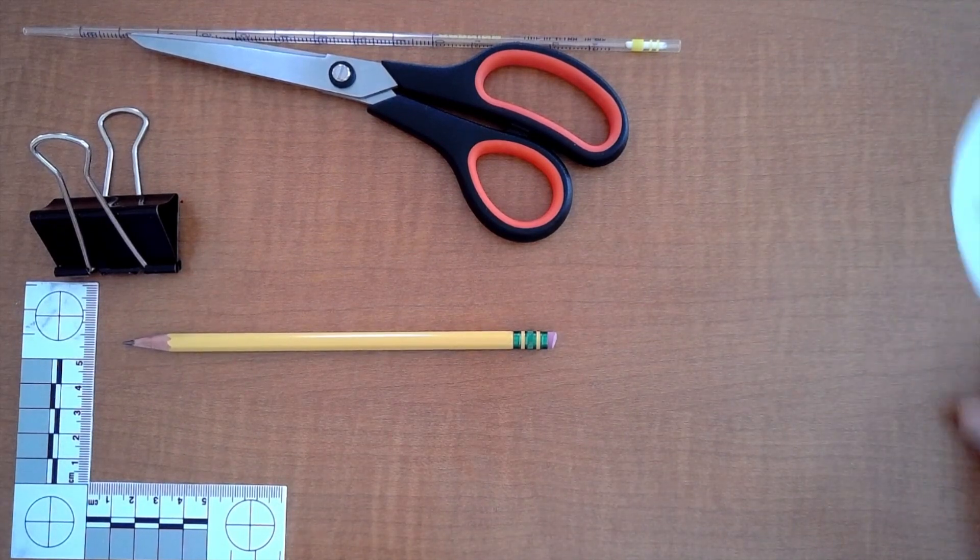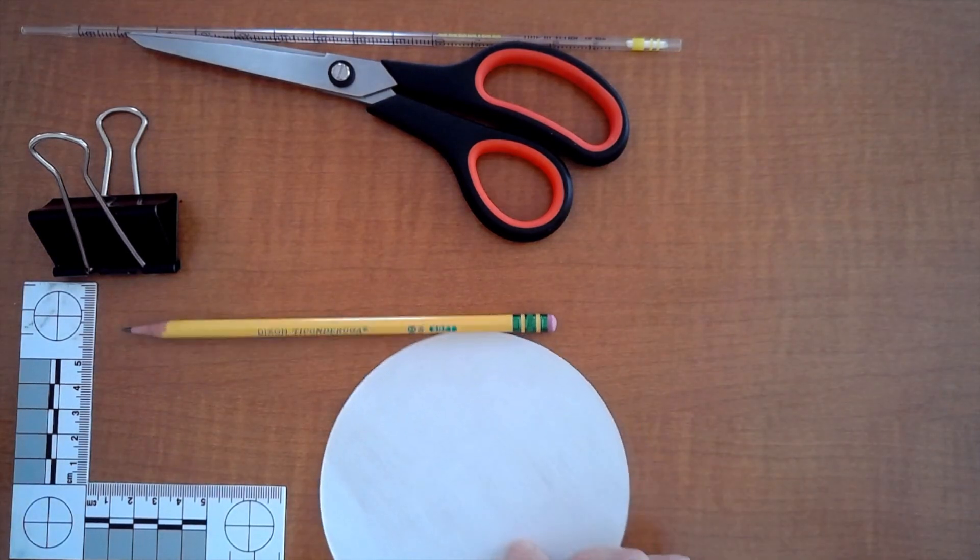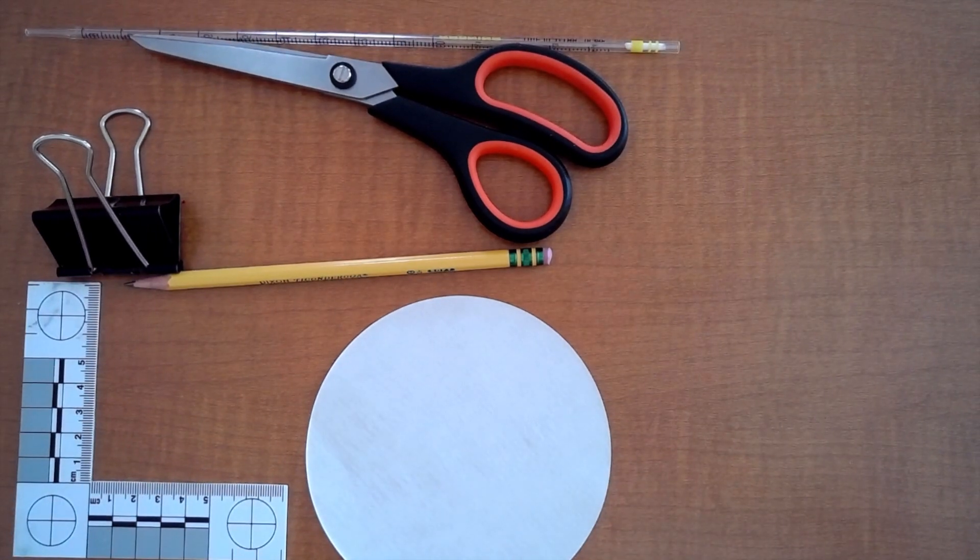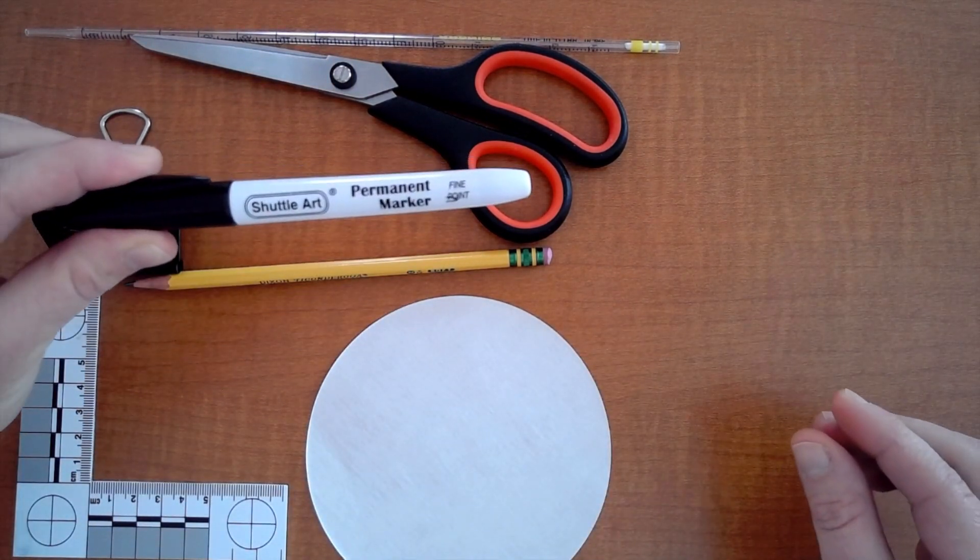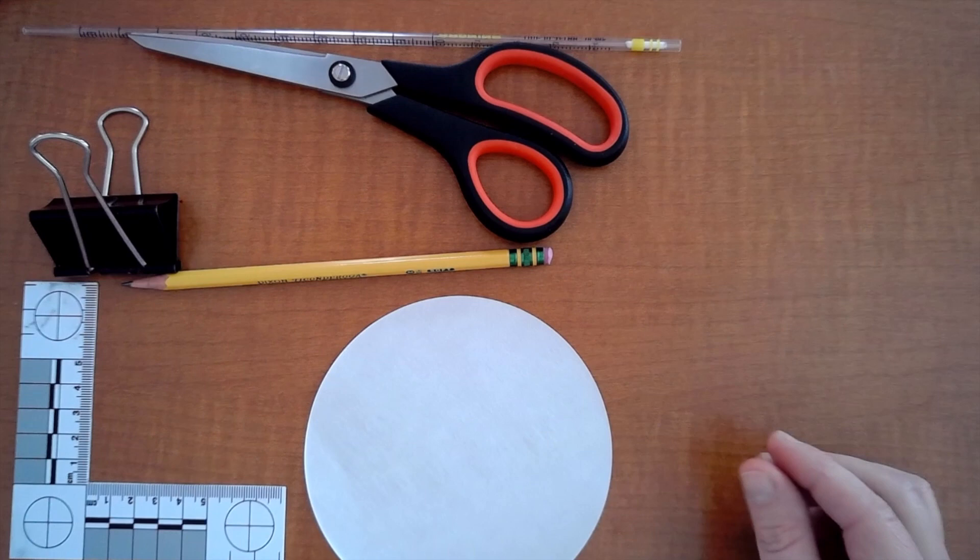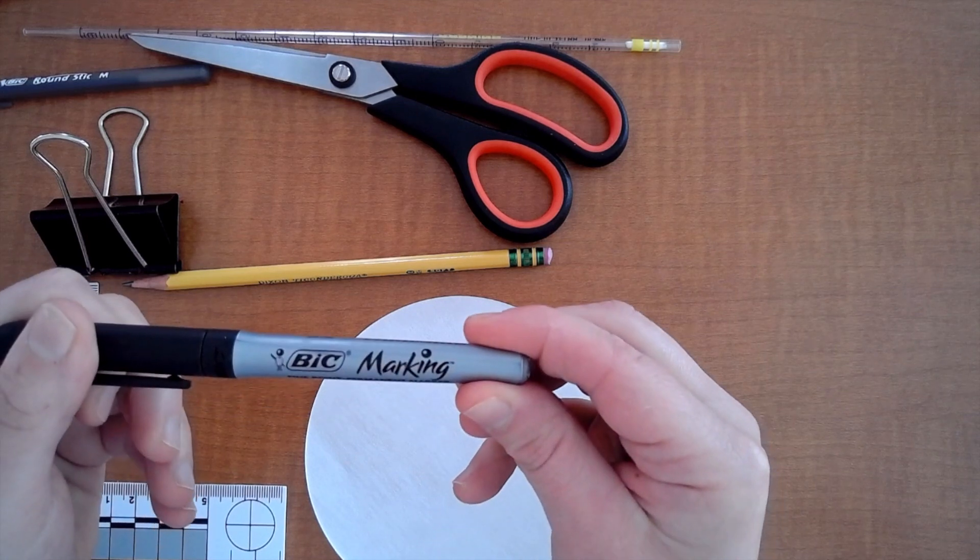You will need filter paper, looks like a big circle, and you will need a bunch of different markers. So let's take a look at pens. We're going to have the Shuttle Art permanent marker, the Bic round stick pen, the Bic marking marker.